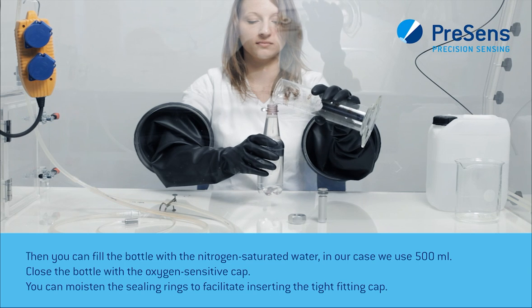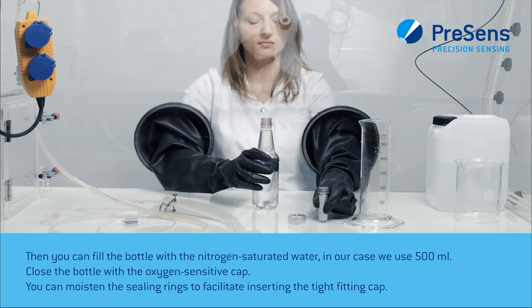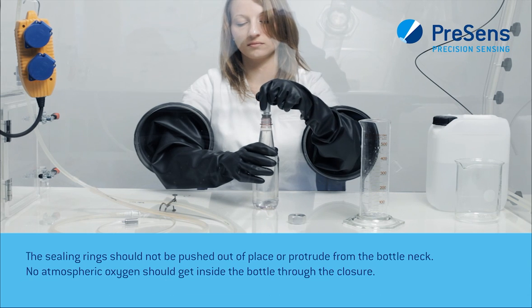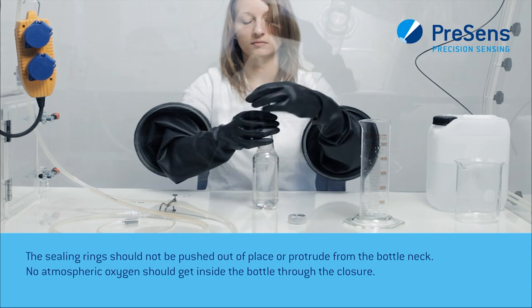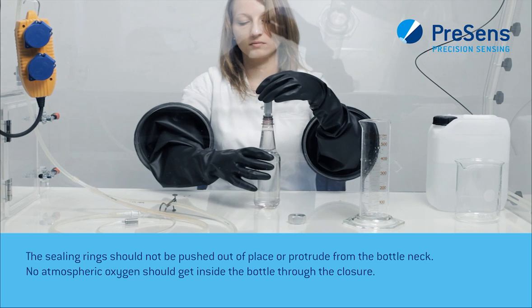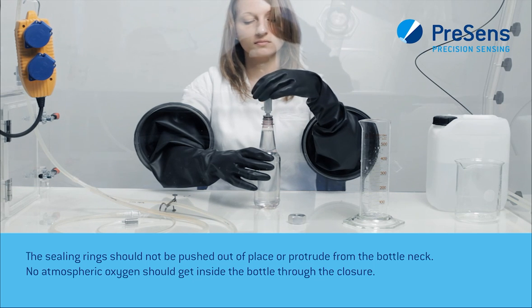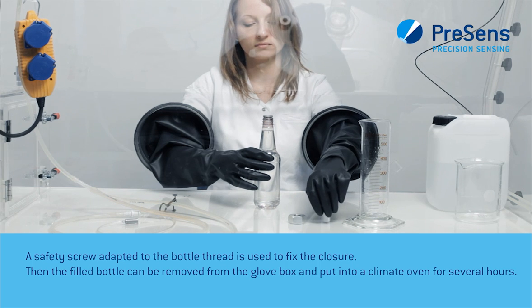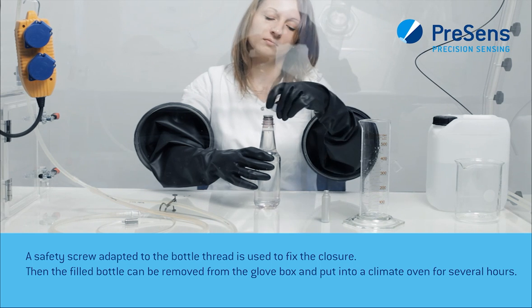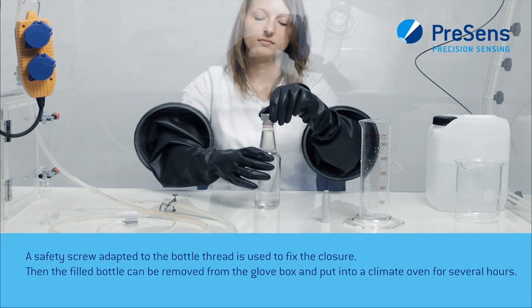You can moisten the sealing rings to facilitate inserting the tight-fitting cap. The sealing rings should not be pushed out of place or protrude from the bottle neck. No atmospheric oxygen should get inside the bottle through the closure. A safety screw adapted to the bottle thread is used to fix the closure. Then the filled bottle can be removed from the glove box and put into a climate oven for several hours.